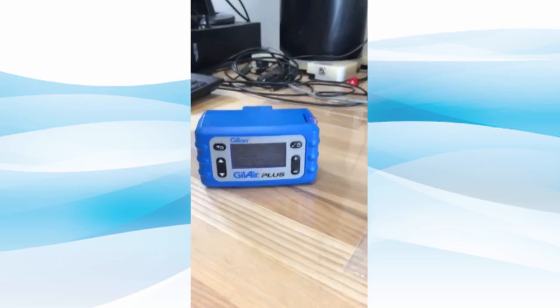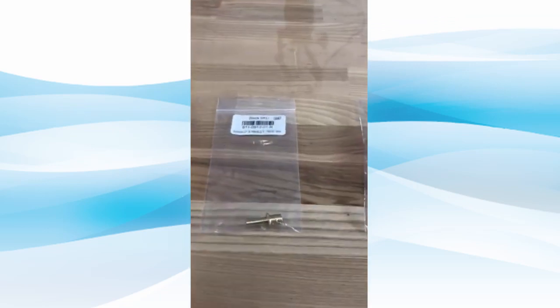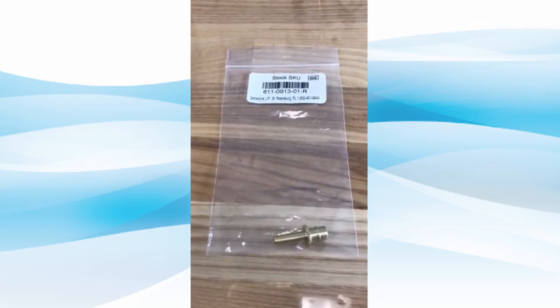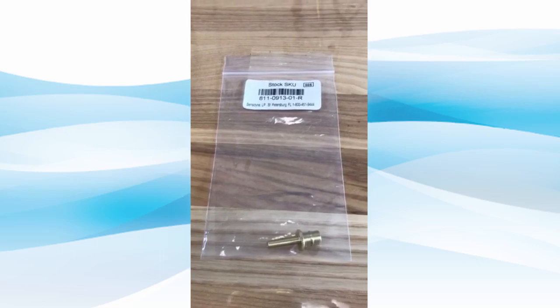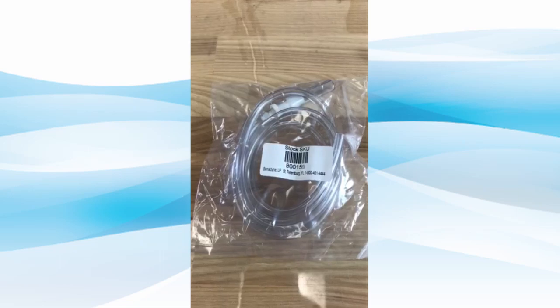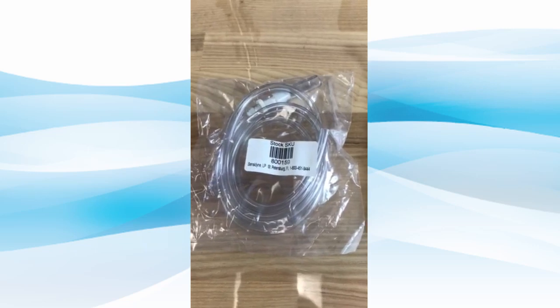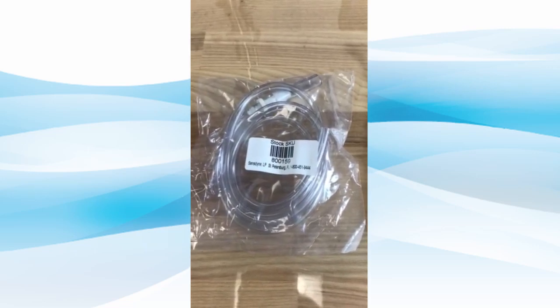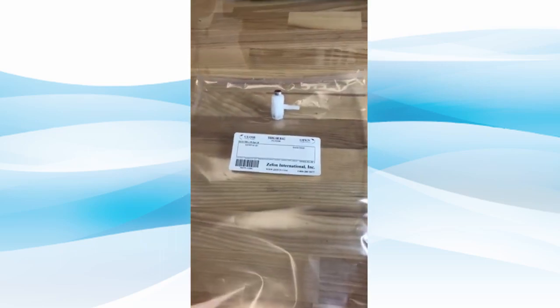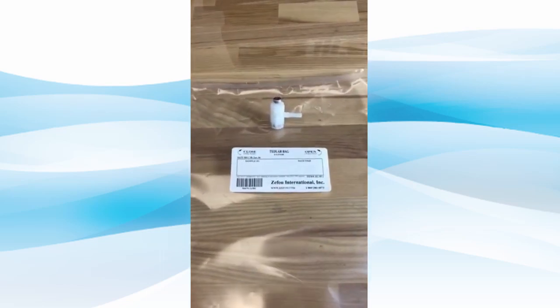You will need the following materials for this operation: any Gillair Plus model pump; an output adapter, part number 811-0913-01-R; a tubing assembly kit, which will contain a 1/4-inch ID section of tube with an adapter that goes down to a 1/8-inch tubing, part number 800159; a Tedlar or Kynar bag with inlet valve; and we also recommend keeping the Gillair Plus operation manual handy for reference.